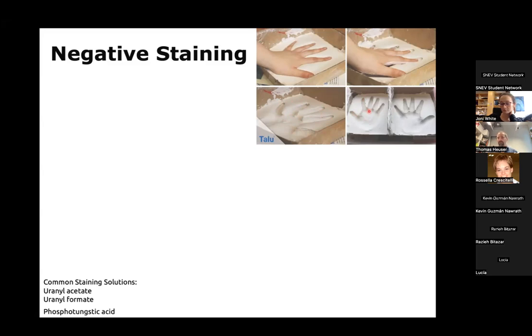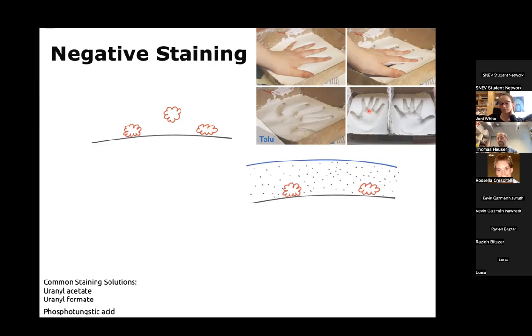So in negative staining, how does this work? The method is super simple. We would typically take something like 5 microliters of your EV solution and put a drop on one of these electron microscopy grids. Then we give it around a minute so that the EVs get a chance to adhere to the surface of this grid. Typically, we would use a carbon film for these EVs to adhere to. And then we're adding a drop of a heavy metal solution. And then we let the whole thing dry, and that's it. So it's super quick, super fast. This can be done in less than 5 minutes.